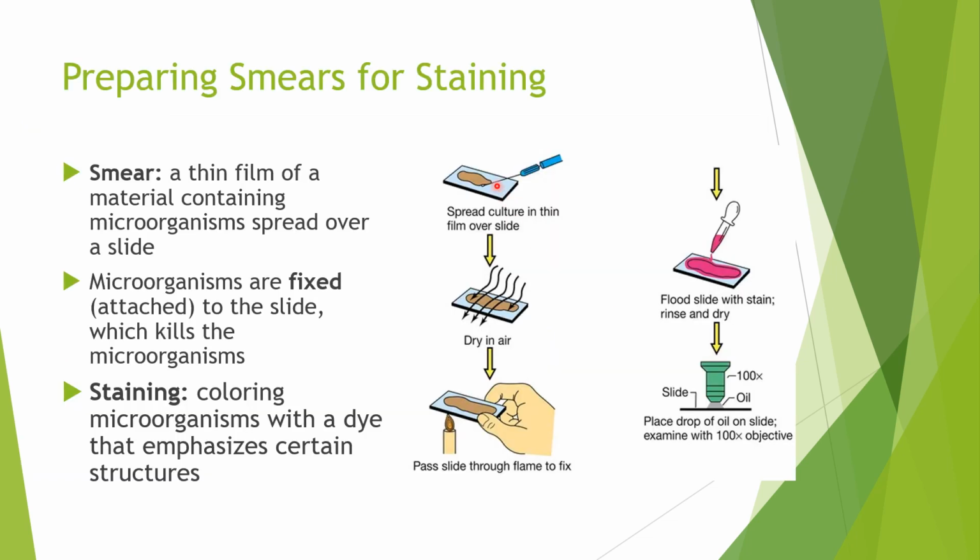Now we're going to introduce how we prep a smear of bacteria so that we can stain it. We're going to go over those steps in more detail in the lab. But for now, I'm just going to introduce you to the concept of how we prepare a bacteria smear, so that we can stain it and visualize our specimens under the microscope.